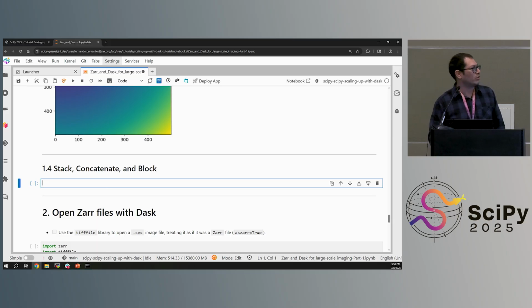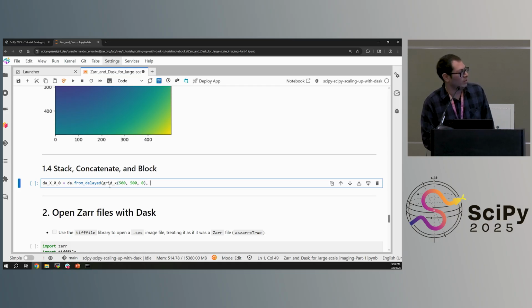So this is nice because NumPy is not going to force Dask to compute. It's going to handle this in a way that it keeps everything in a Dask array until we apply compute. There are some cases or some functions that force the computation. We're going to see some of those, and for those, we're going to use some ways that Dask gives us to make, again, those computations lazy. Just to show you that you can apply other operations, you can apply, for example, the cosine function to the D3, and in this case, the result is going to be an array because it is applying that element-wise. But again, it's a Dask array until we compute that.